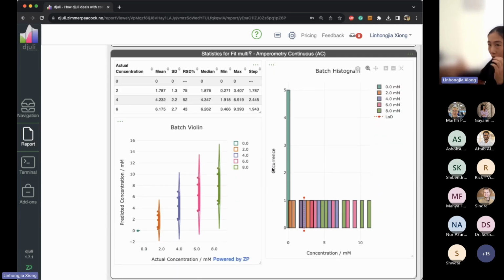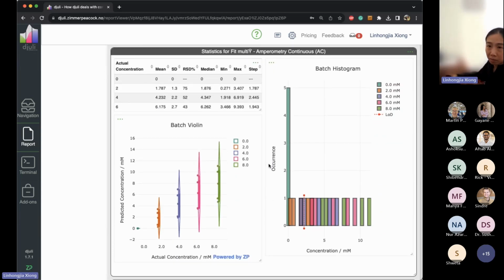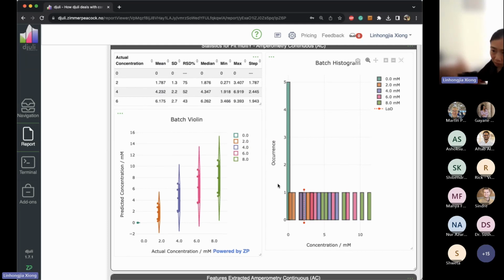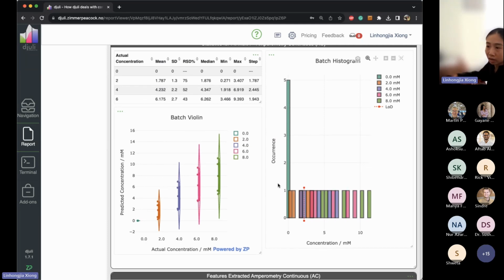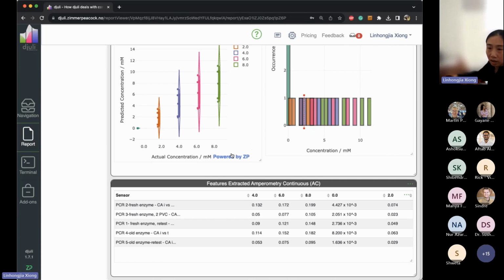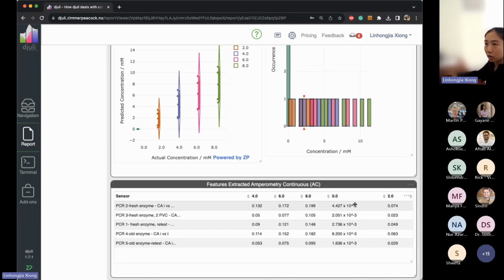Also, there are some government bodies that ask for more detailed analysis, so we also show how each concentration varies from the others. This also represents your sensor-to-sensor reproducibility, which is a key factor for the report. The last one reflects the plot as shown above, giving us how the concentration is evaluated at each sensor and at each concentration.